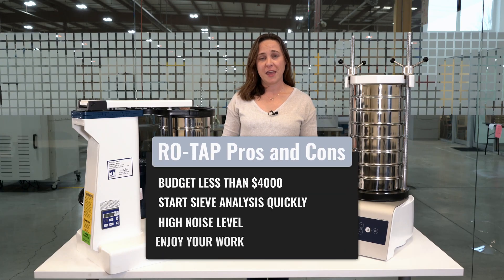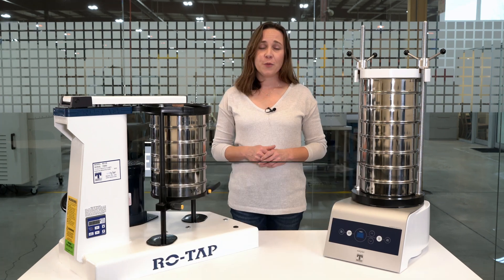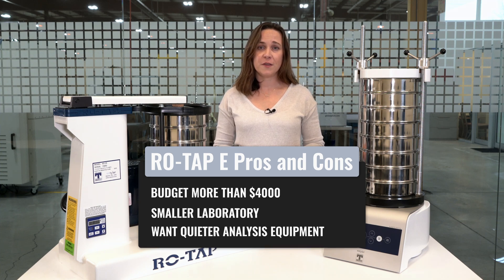You'd probably benefit from a mechanical ROTAP sieve shaker if your budget is less than $4,000, you want to get up and running quickly to do your sieve analysis, or if you don't mind the noise level. You'd probably choose the ROTAP-E if you have a slightly bigger budget, a smaller space to work with, and you're looking to reduce the noise level in your lab.